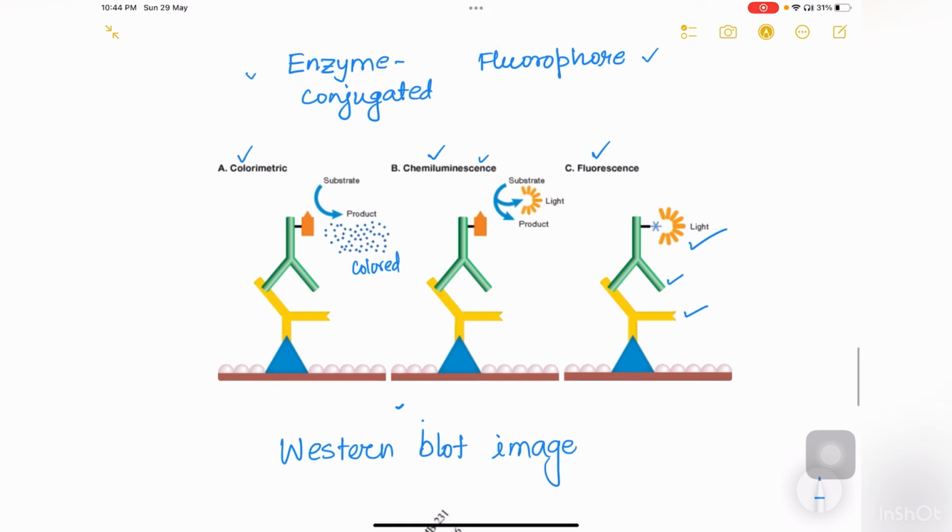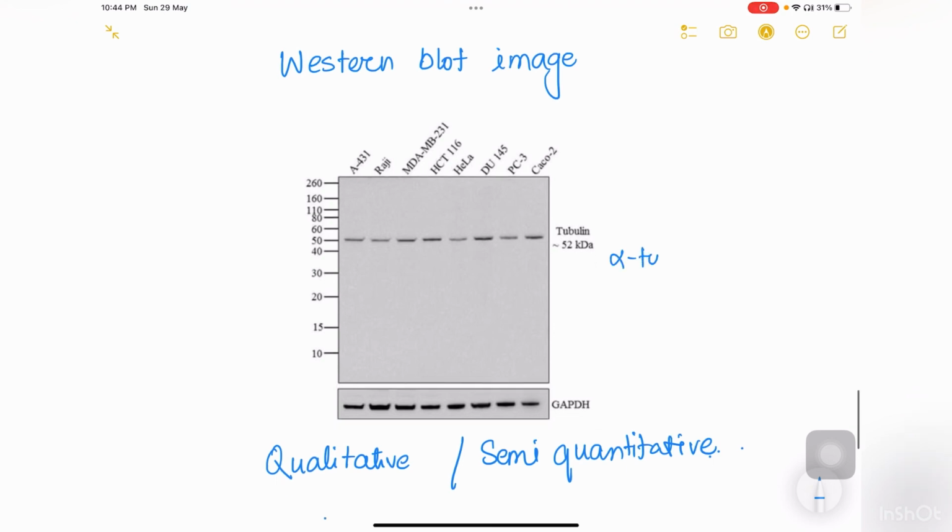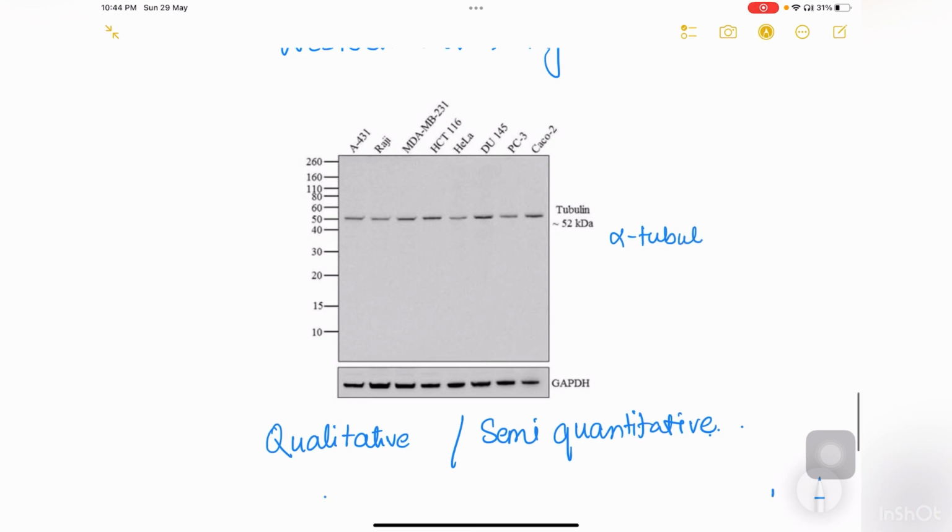And now we will see a typical Western blot image, how it looks like. This is how an image looks like. From different cells, cell lysates are taken, and with the help of anti-tubulin antibody, tubulin protein is detected from different cell lysates. These are the different cell lysates where this tubulin protein is detected.